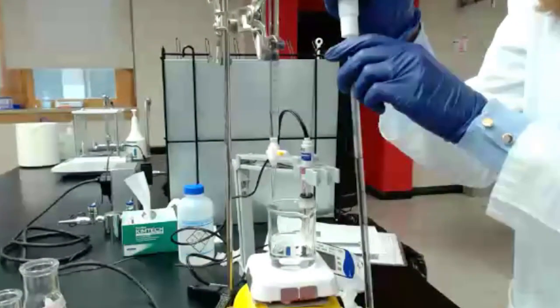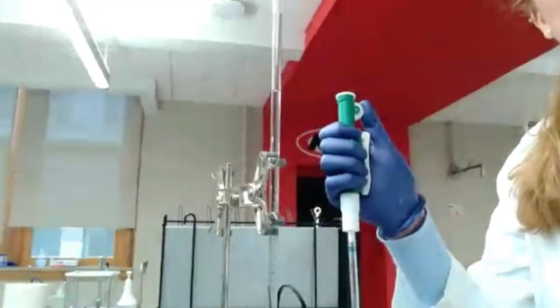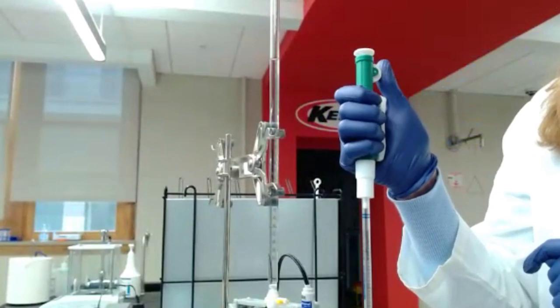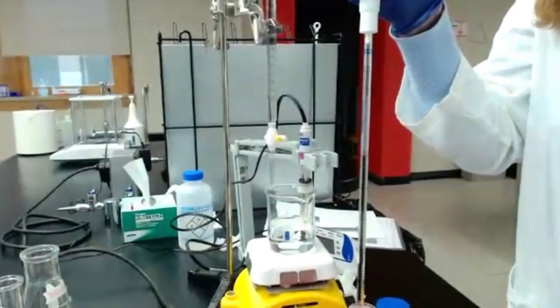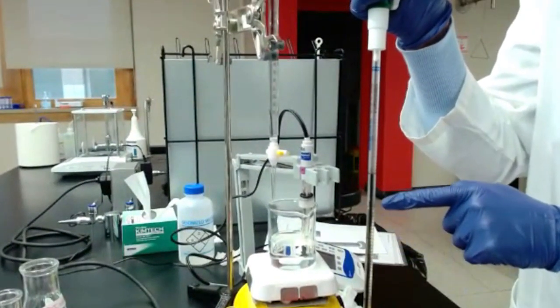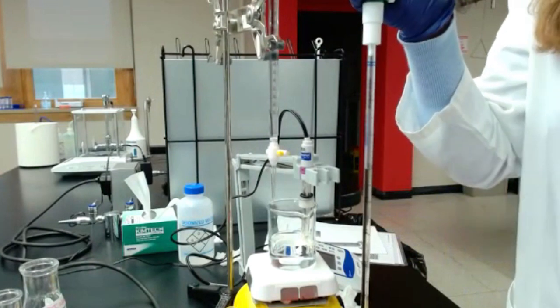To take that, you will use the little pump. You will use that wheel to move down to have the juice getting into the pipette. You probably see that I'm pipetting the juice up to 5 or 0.